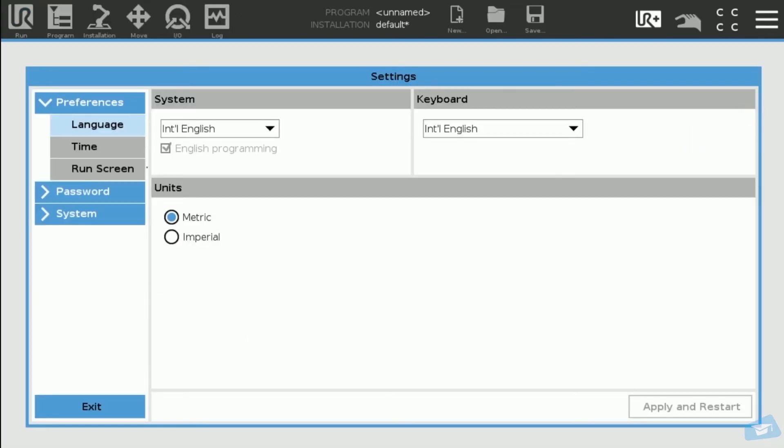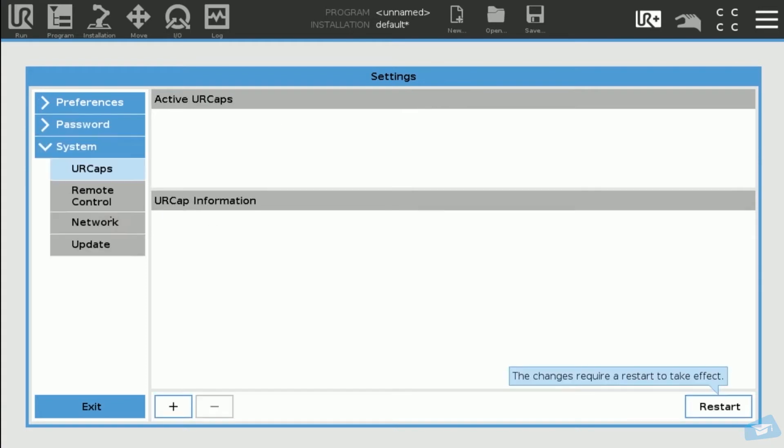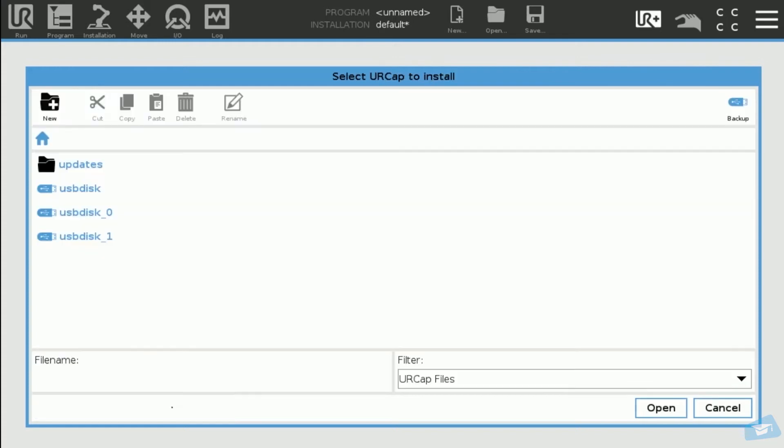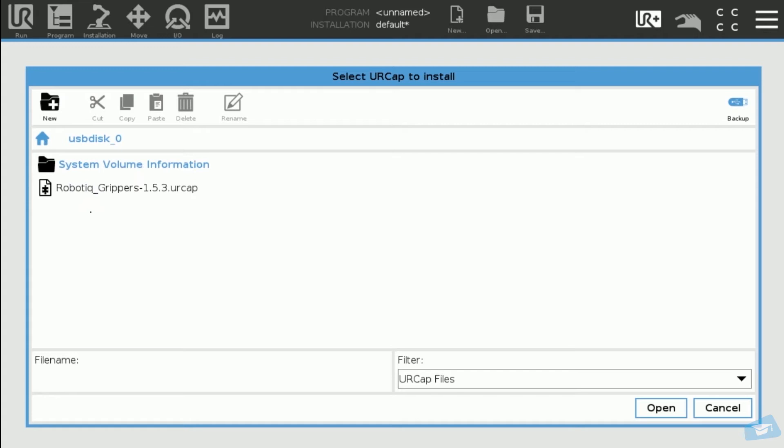In the Navigation Pane on the left, tap System and then UR Caps and tap the plus button and select the corresponding USB drive. Tap the UR Cap you wish to install and then tap the Open button.